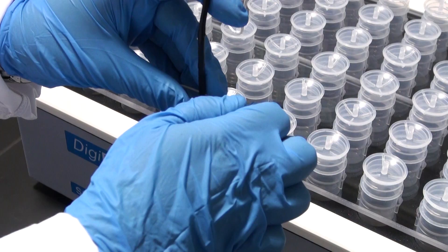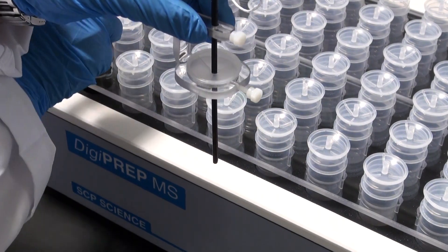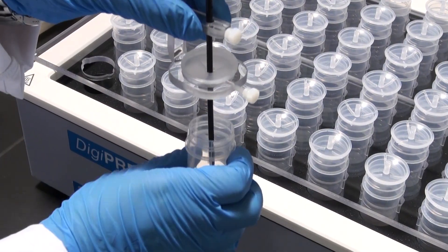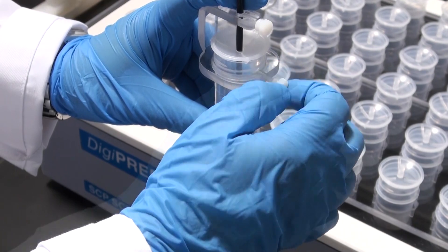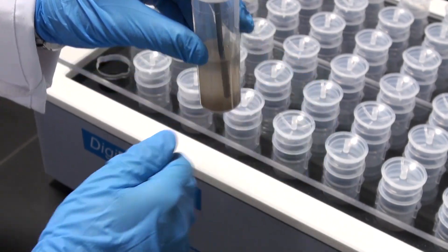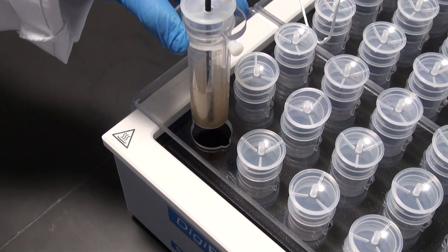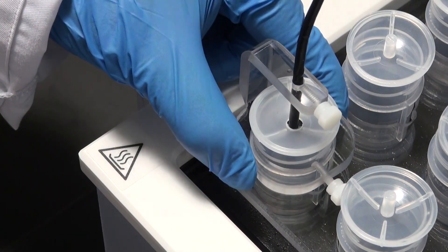During evaporation or digestion, sample temperature may deviate from the target temperature of the system. Digiprobe provides direct sample temperature feedback to the controller, which can then adjust the temperature of the Digiprep block as needed on a continuous basis.